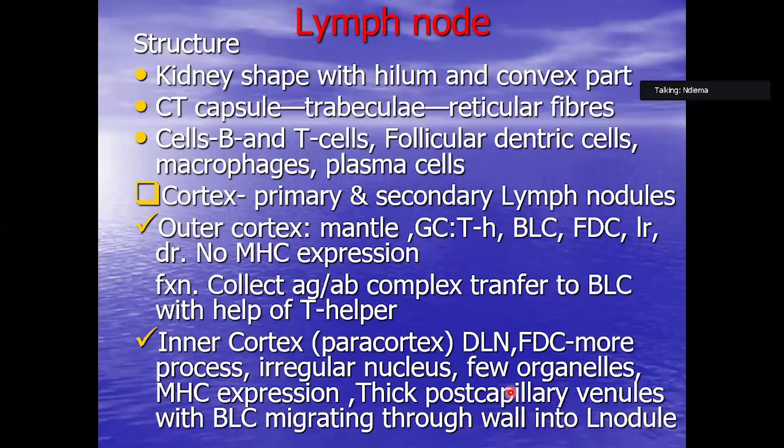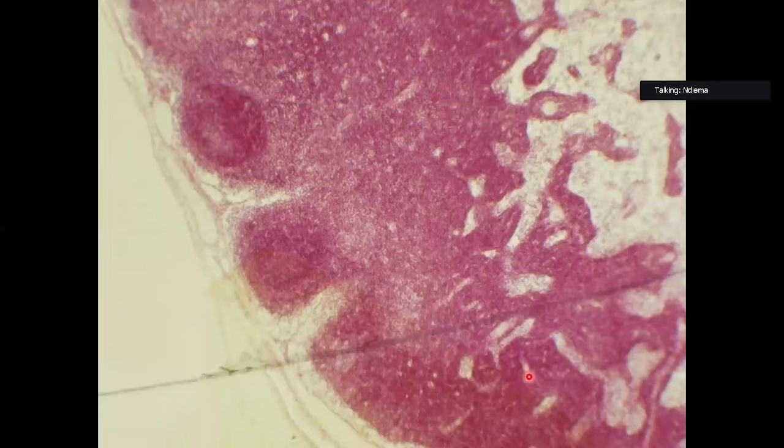So this is a global view of the lymph node. We have a capsule, and within the capsule, this is fibrous connective tissue, penetrating into the organ as trabeculae. Entering at the capsule, we have the afferent lymphatic vessels. So afferent lymphatic vessels enter the capsule at the cortex.